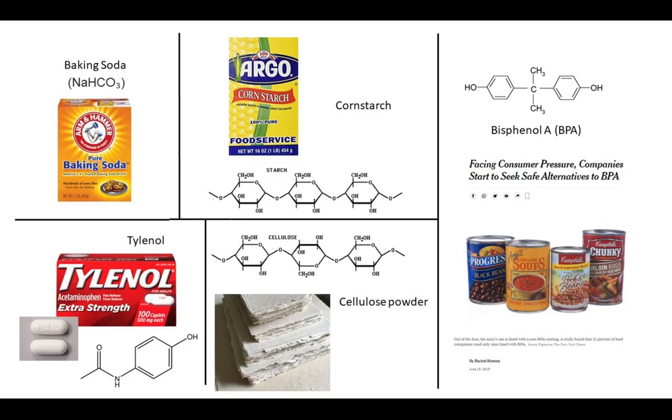Okay, so moving on to cornstarch and cellulose. These are very similar in structure. It's just a matter of which way the groups on the chain point, up or down, and the way in which the molecules in the chain hold hands. See how all the oxygens in the starch point down in between the chains, and in the cellulose, they take turns pointing up and down. So I'm wondering, based on this information, do you think the recorded vibrations are going to be different or mostly the same?